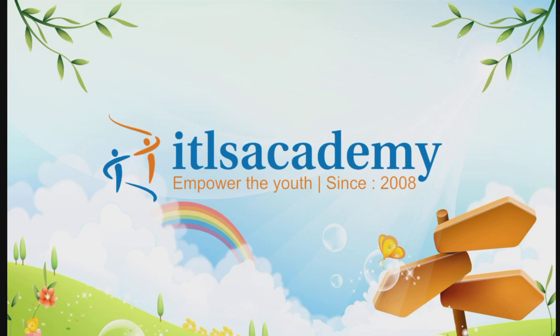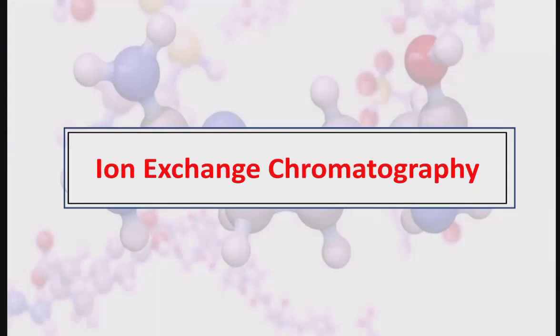So today in this lecture we are going to study our next analytical technique, that is ion exchange chromatography. In the previous lecture we have seen various types of chromatography techniques, that is thin layer and paper chromatography, HPLC, gas chromatography, column chromatography. So in this particular lecture, we are going to study what is ion exchange chromatography.